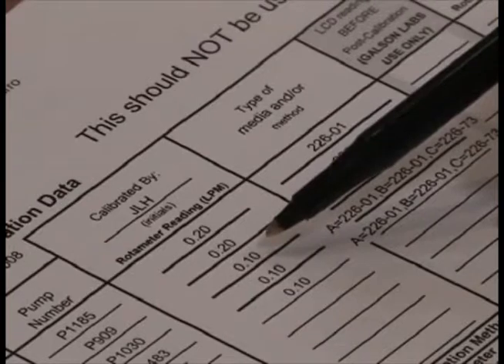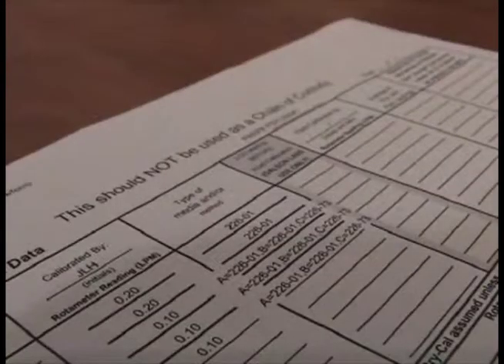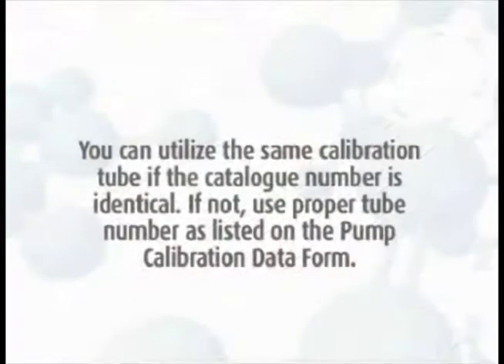After you are satisfied with the flow rate, verify the value matches that on the pump calibration data sheet, and repeat the previous steps for the additional port marked B for dual splitters, and B and C for triple splitters. The pump calibration data sheet has separate calibrations for A, B, and C ports, so be sure to record your value with the correct tube sleeve.